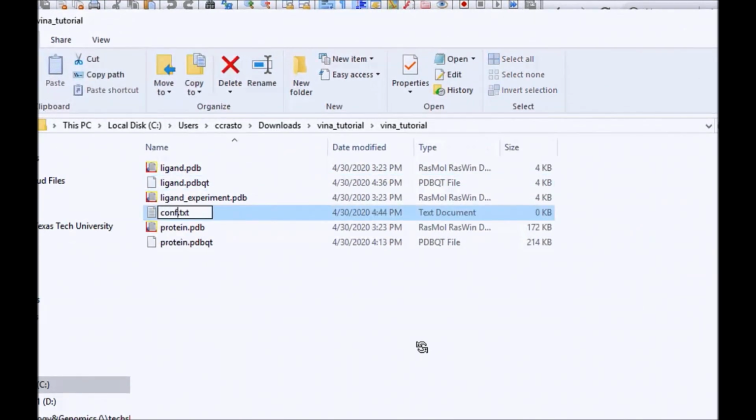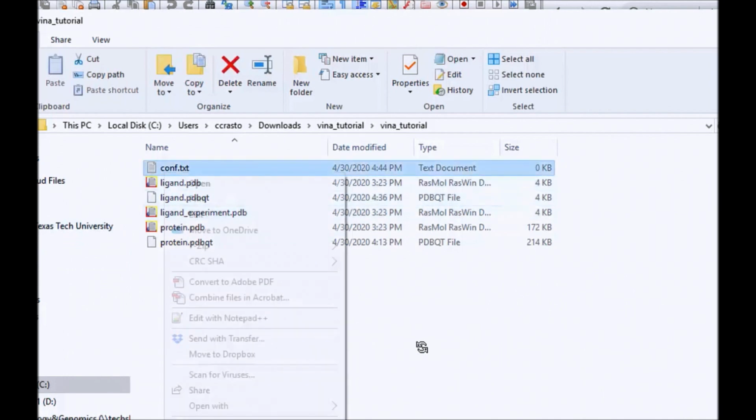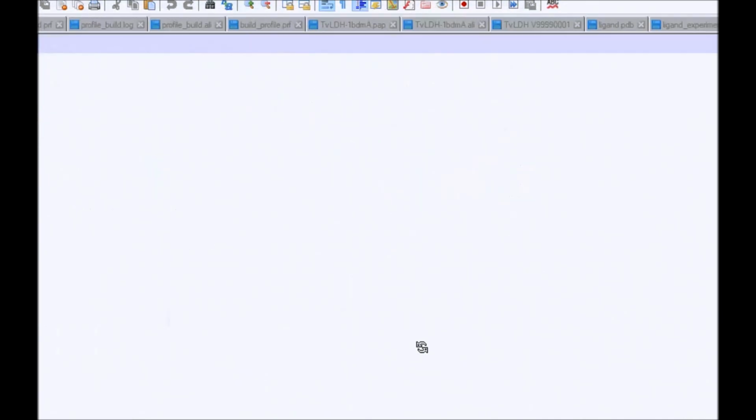We're going to call it conf.txt. And now once again, if you're a Mac user, whatever you use, an ASCII file, a text file for editing, should be just as good, because again, it's just looking for the internal commands that you put into that file. And while we're at it, I might as well open it in Notepad++, because that's the one we have to populate now.